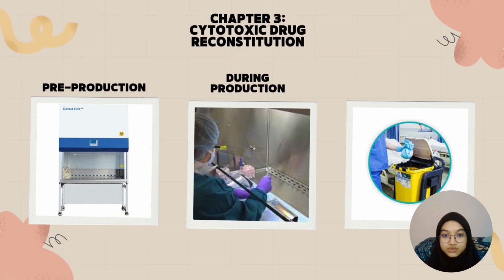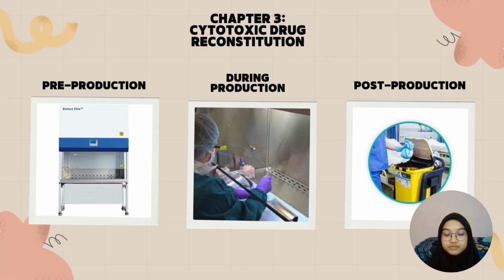These are pictures related to CDR production. For pre-production, we have a picture of the CDR safety cabinet. During production, we have a picture of a personnel doing compounding inside the CDR safety cabinet. And for post-production, we have a picture of disposing of cytotoxic waste.